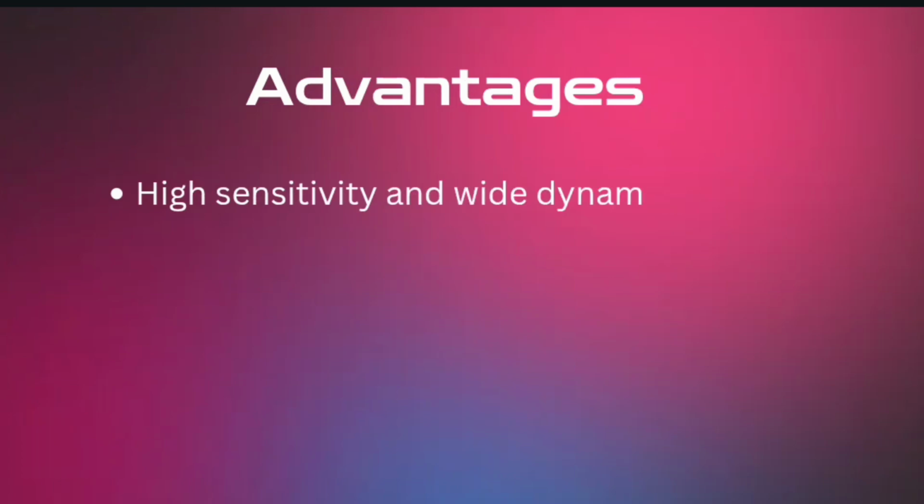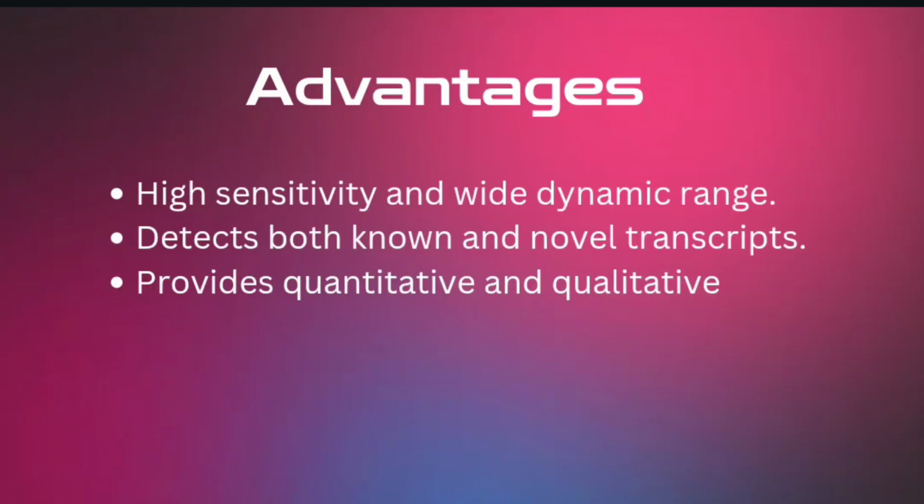There are some advantages in this process. That is, RNA sequencing has high sensitivity and wide dynamic range. It detects both known and novel transcripts and provides quantitative and qualitative data simultaneously.